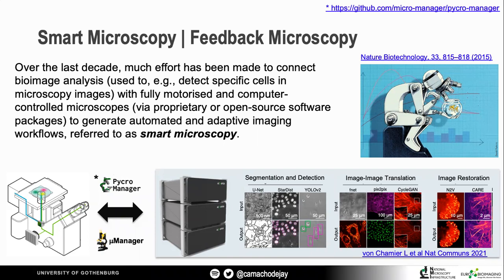So the idea is that the microscope is going to look at the sample, it's going to take a particular image, we're going to do some image processing, and then we can figure out, for example, are these cells in the right conditions to do a higher resolution screen? Yes or no? They are in the right condition. Okay, now I send a message to my microscope that says, please change the behavior, right?